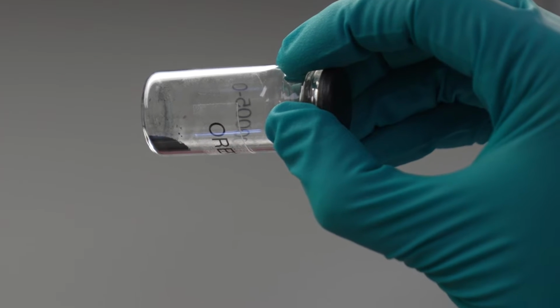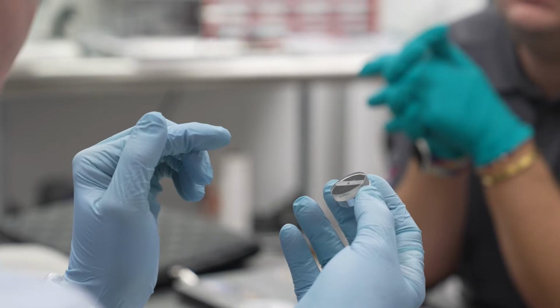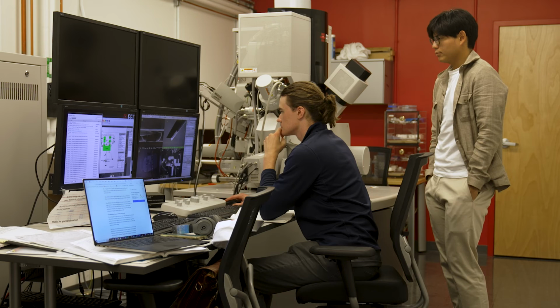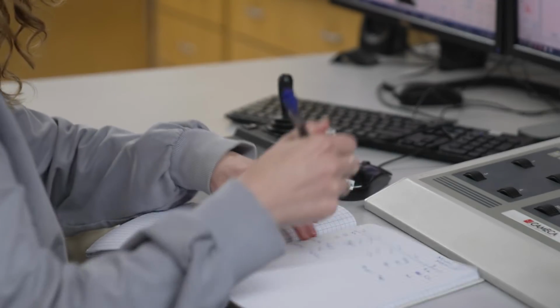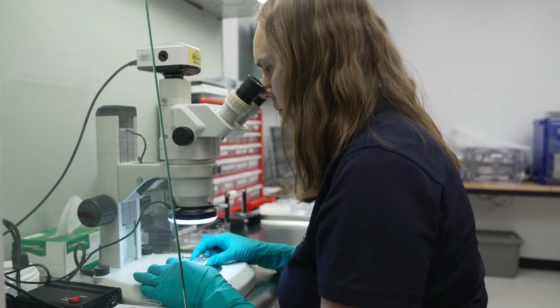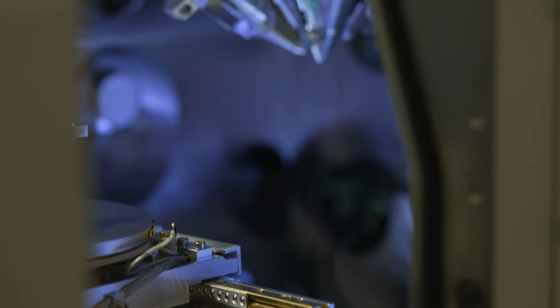We got a sample initially from the quick look sample that we brought back to the university, and we also got a recently allocated aggregate sample of particles on the order of a few hundred milligrams, that our students and postdocs are currently studying in the lab. The initial step was basically a triage, going through the particles, documenting, getting optical images of the sample, seeing what they look like, classifying the sample, so we can actually decide which particle will be studied for what particular purpose.